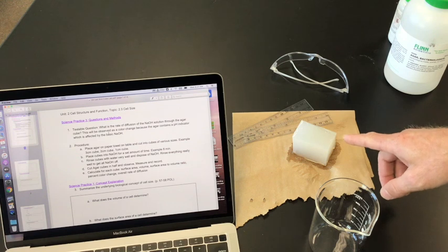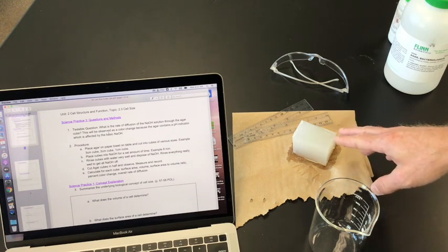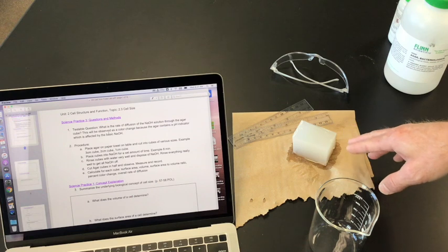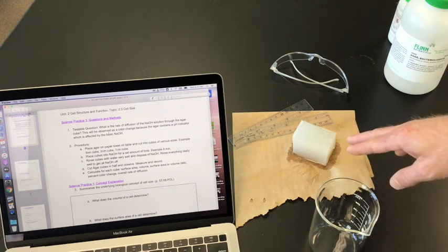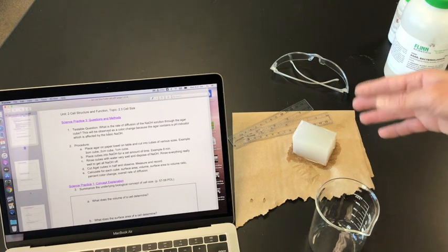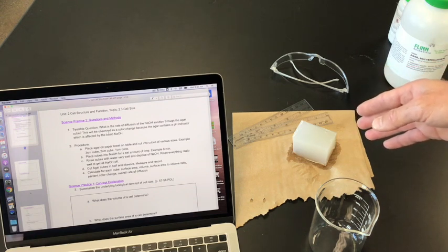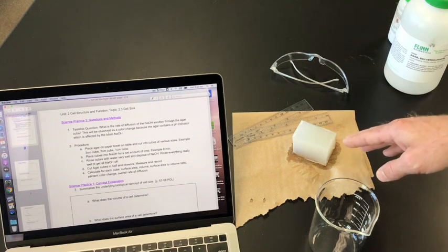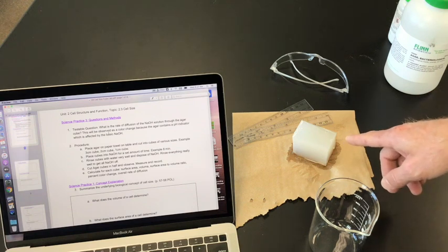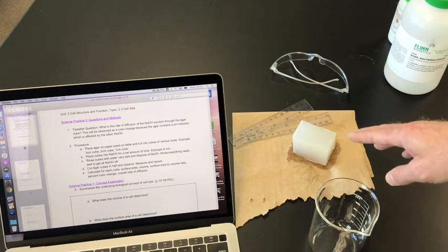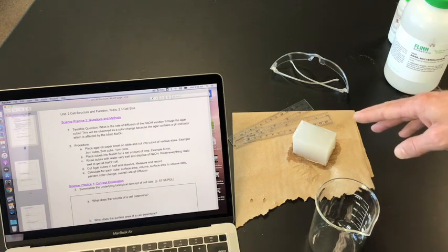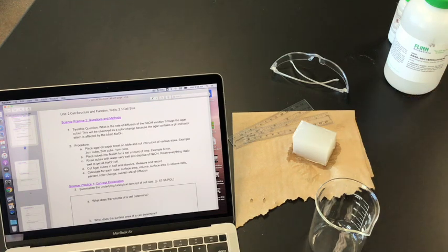When the block was exposed to a basic solution, this was made using purified water, pH of neutral or even sometimes purified water can be considered a little bit more on the acidic side, so pH of 6 or so. We're gonna put this in a solution of sodium hydroxide, which is a pH of, oh I don't know, 10, 11, something like that. It's gonna go through a color change. So how fast, what is the rate of that color change?